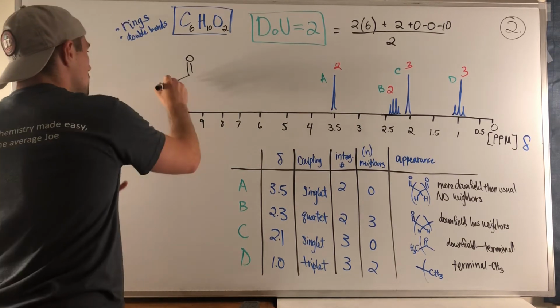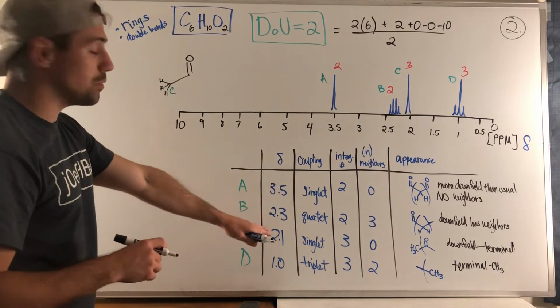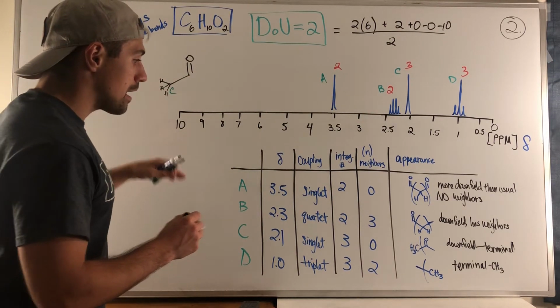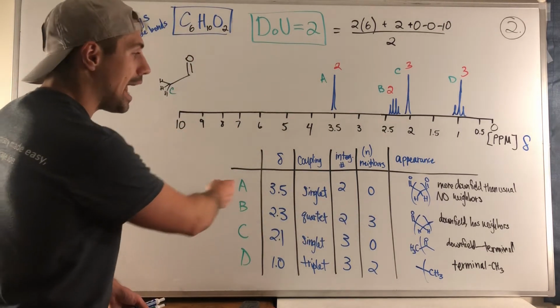Because if you take a look, the chemical shift lines up. We are de-shielded, more de-shielded. We are downfield. We are above 2. We have our CH3, no neighbors, okay? On the other side, we're going to have a CH3. I won't draw that quite yet. But let's see if we can maybe draw A, make sense of it.